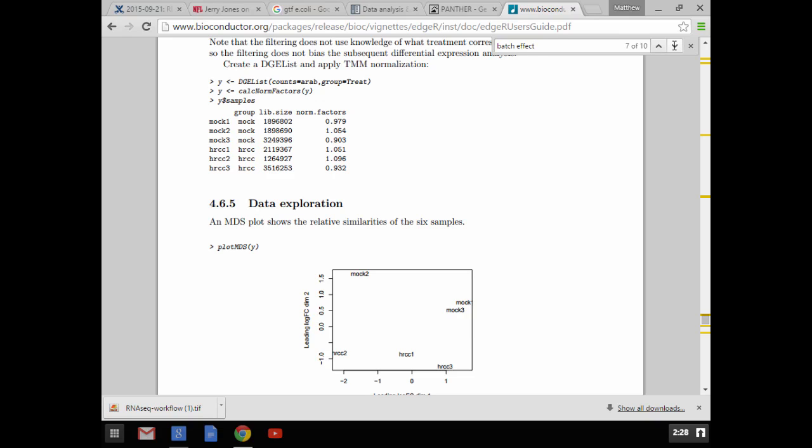Those of you that use HPC regularly, or might be using HPC regularly, it's very easy to say, I'm going to run all of my analysis as qsub. So I have 55 samples, I'm going to submit them all to run. But then you need to wait for all of them to finish. And while you could submit your EdgeR stuff to run on the cluster, it's actually a really fast process, right? It took 2 or 3 minutes to run on 4 samples.